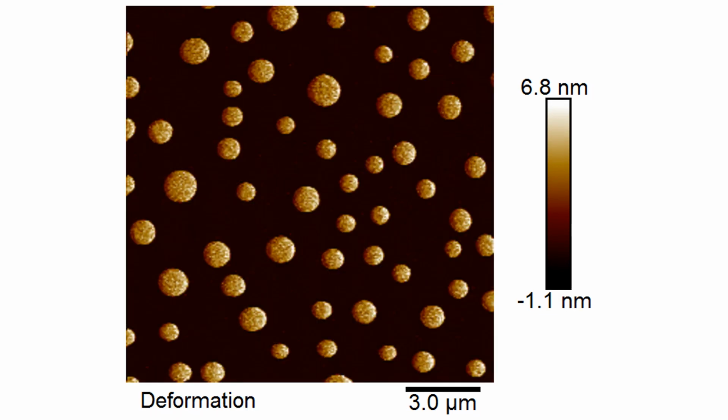The interesting capability of my instrument, the AFM that I work with, is that it has the ability to do force mapping at all points on the height data image. So now this is the same sample. Instead of height information, we're looking at deformation, or how far into the sample we are pressing with our tip at each point on the image.